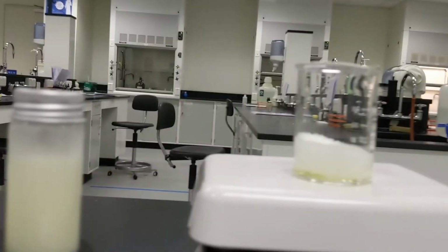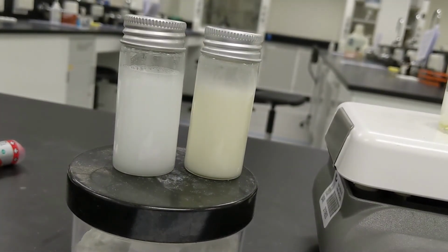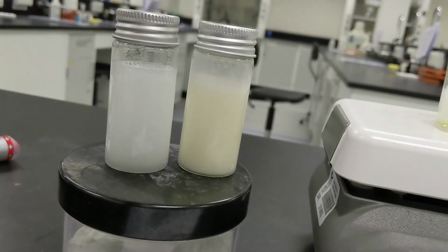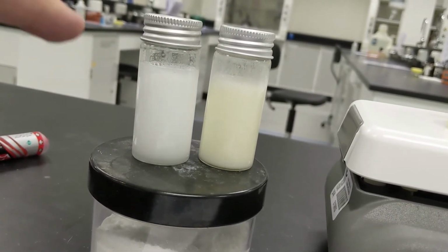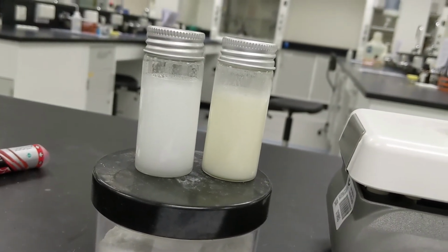Now, as I was waiting for that to happen, I have my emulsions here. Still haven't broken. They're still emulsified. So the soap, the sparkling, and the egg white still have these, for the most part, completely mixed. And it's been about 10-15 minutes. You can still see the foam on the top, but again, that's typically from the soap.